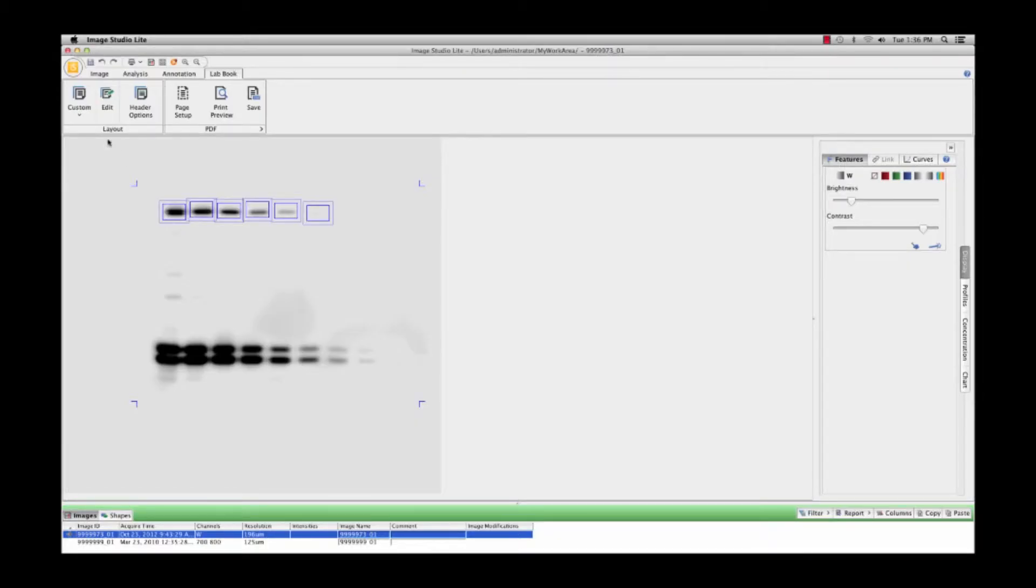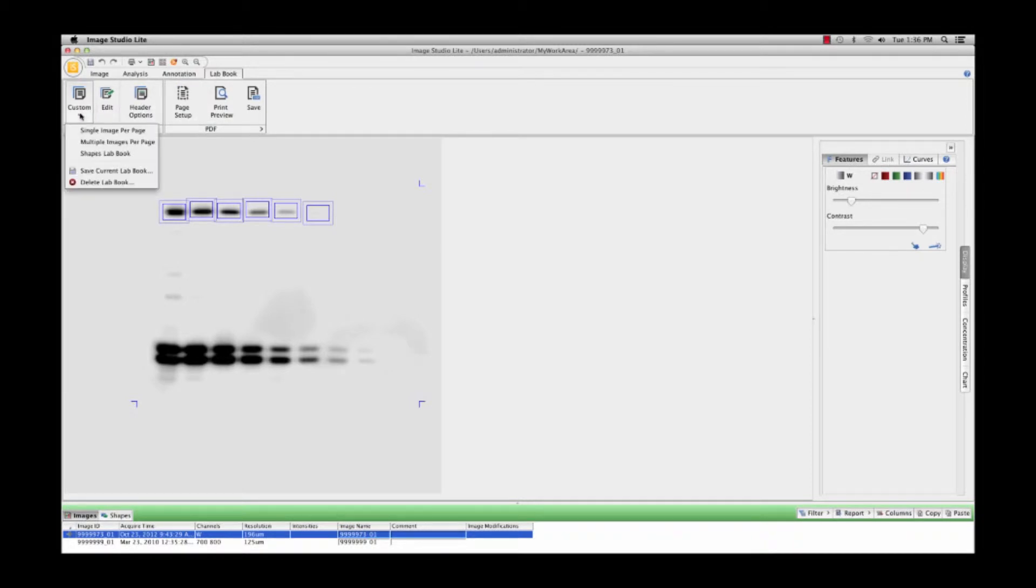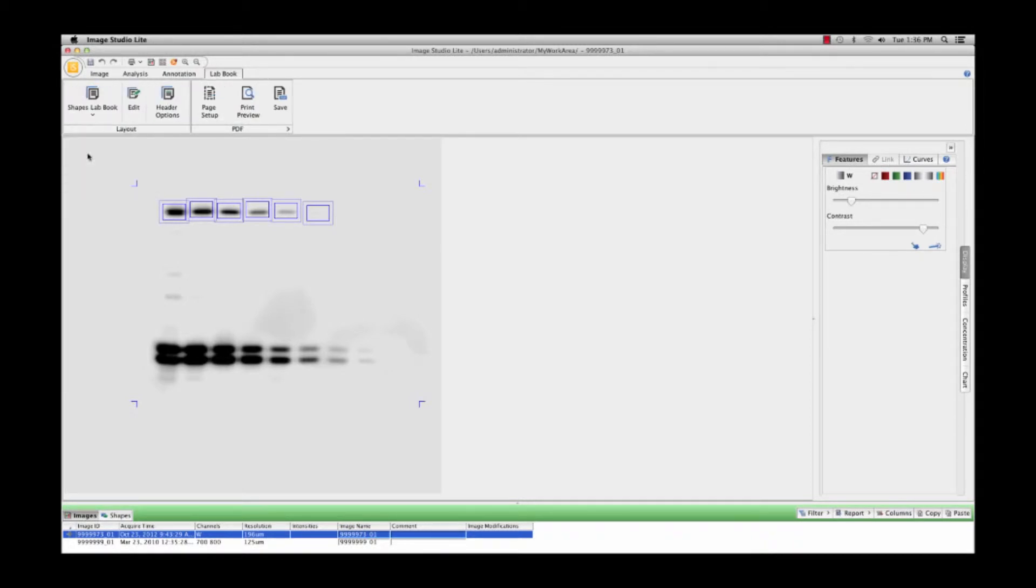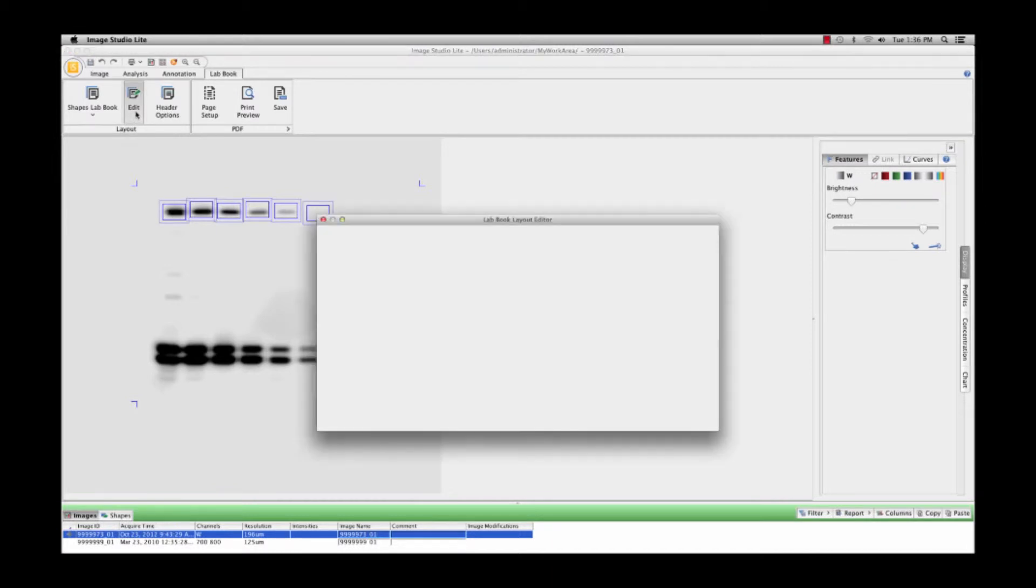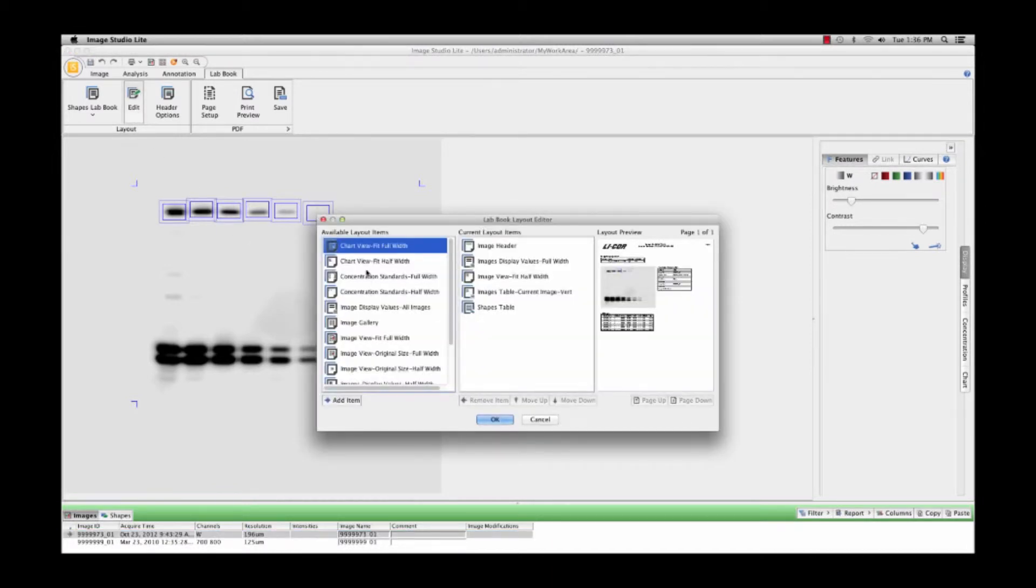To create a lab report, first select the LabBook tab. You can select a standard LabBook layout or create a customized layout by editing any of the predefined layouts.